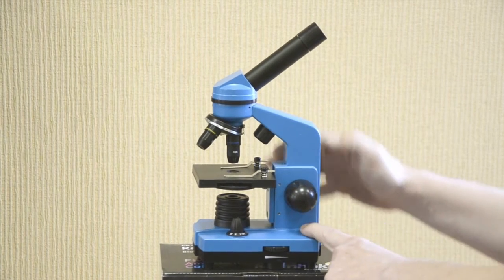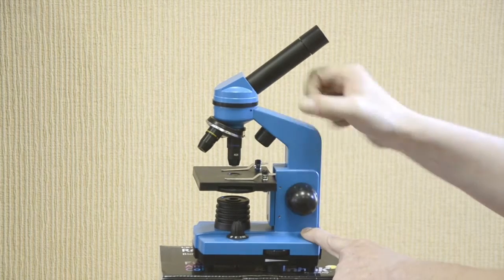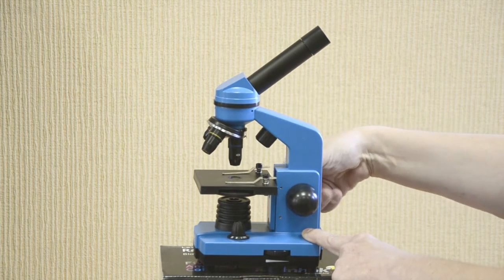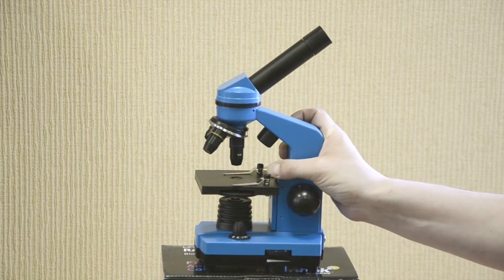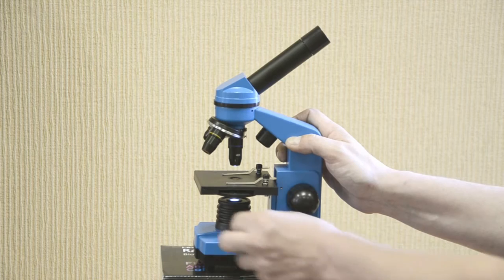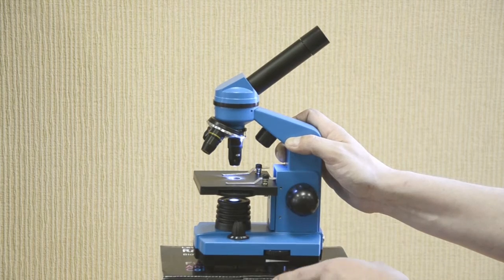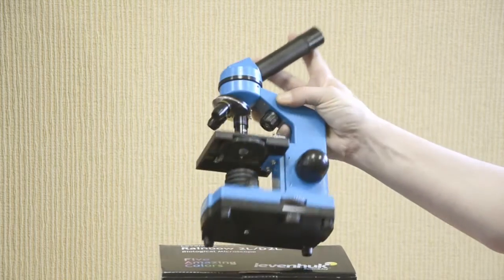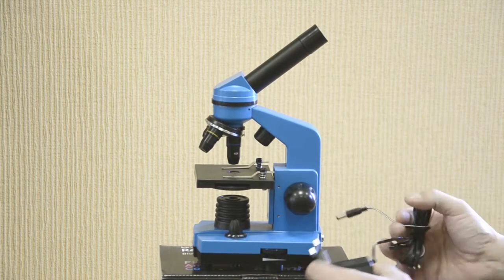The microscope features a monocular head inclined at a 45-degree angle, a 10X eyepiece, a revolving nosepiece with 3 objectives, a focusing knob, and slide holders. It has both a lower and upper light source with combined illumination and adjustable brightness. Here's the diaphragm disc. The device can be powered by 3 AA batteries or by an electrical outlet — a 110-volt or 220-volt AC adapter is included in the kit.